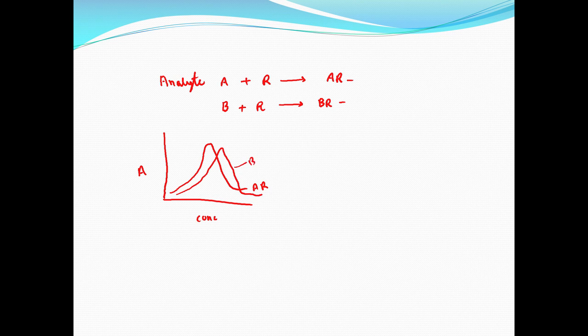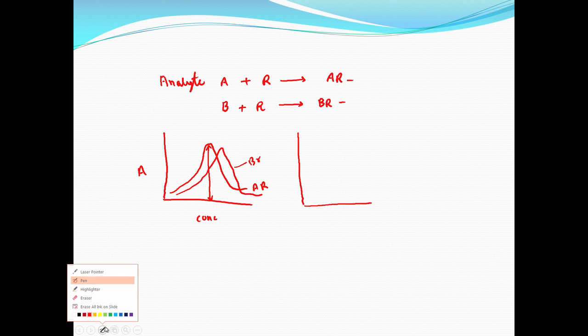Any measurement of a sample containing both AR and BR would be the sum of this as well as the other one, the absorbance of this plus this.